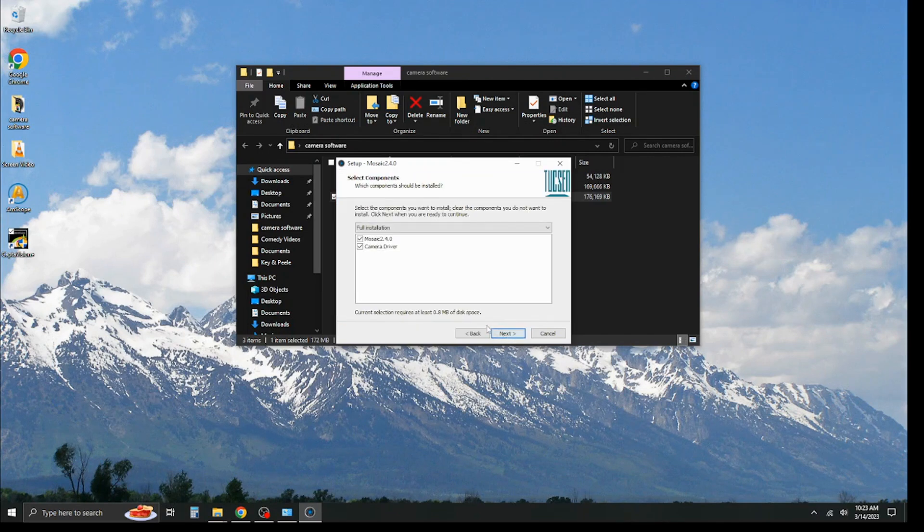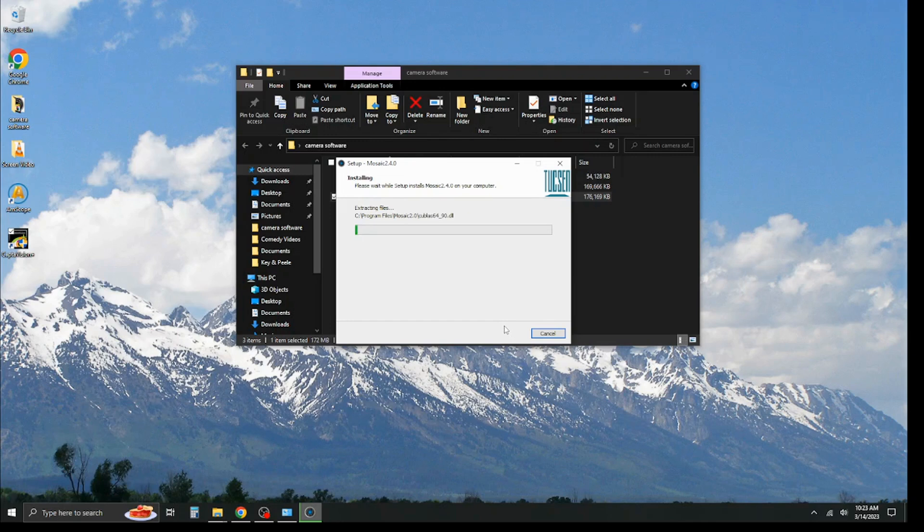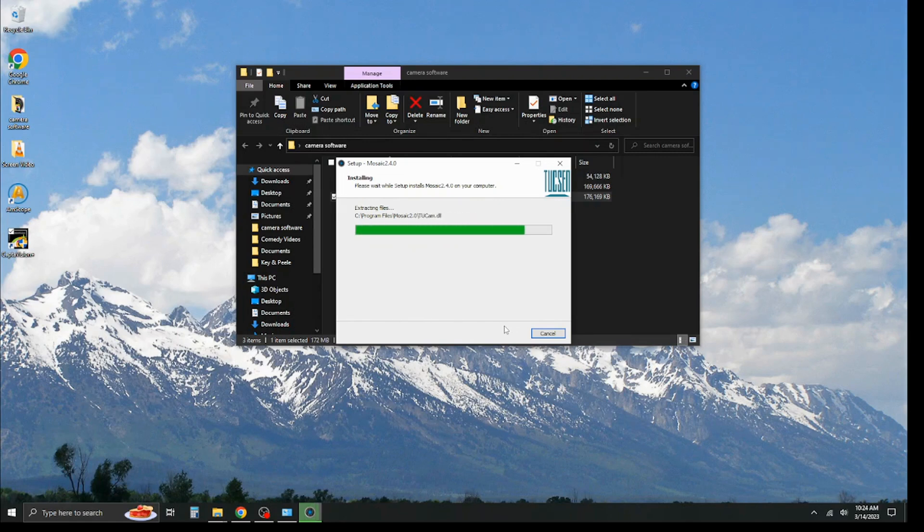Again, the default location is fine. And this does, again, do the software and the camera drivers, which is very handy because once you plug in your camera, it's already set and ready to go. So, we go ahead and extract the install files and get everything set up for you. Just takes a couple of seconds once it's installed.